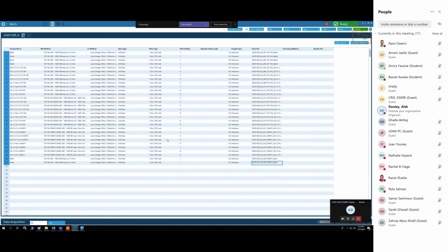So we are talking about not the very, very soft tubing, but the little bit harder tubing that's clear. You should see all bubbles out of that. See, that's another reason why I don't like those trays, because you can't see the bottom part of the bottle that's in the tray. It's hidden. And then if you're not so tall to see inside, you don't see this kind of problem that we had.